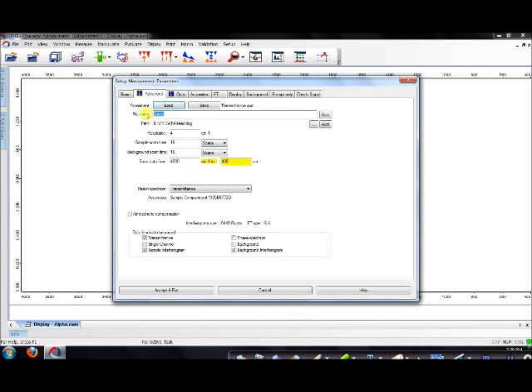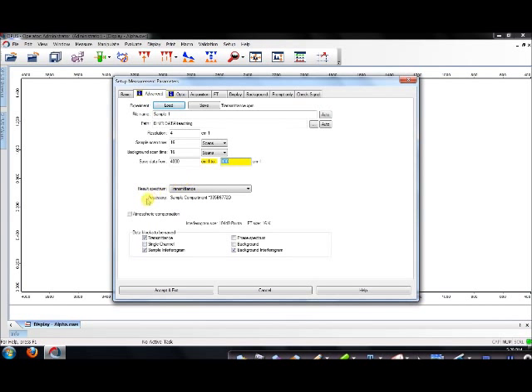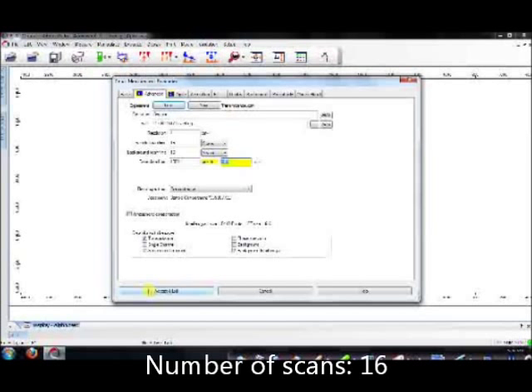Under Advanced, you can change the file name and the path to the folder that you want to be saving this spectrum under. At the same time, in this column, you can see the resolution. You can adjust it, sample scan time, background scan time, and saving data from the range of the wave number that you want to view.